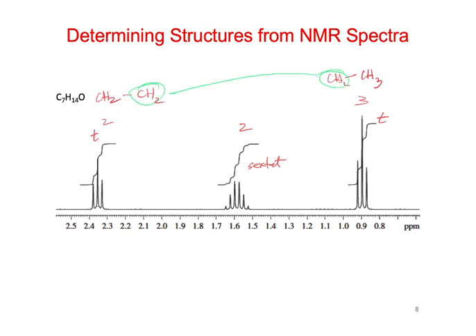So what we're basically seeing is just a propyl group. And then you connect them together. Right, and so because we have 7 carbons, we need at least 2 of these, symmetrical, like this. And we need something in between.